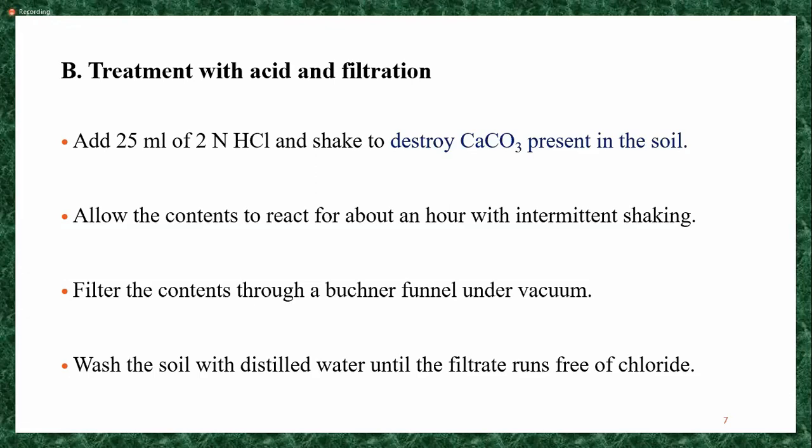I hope you all know the Buchner funnel. In coming slides, I will show the Buchner funnel. I hope you saw that in laboratory techniques. So using a vacuum setup, we can remove all the chlorides.